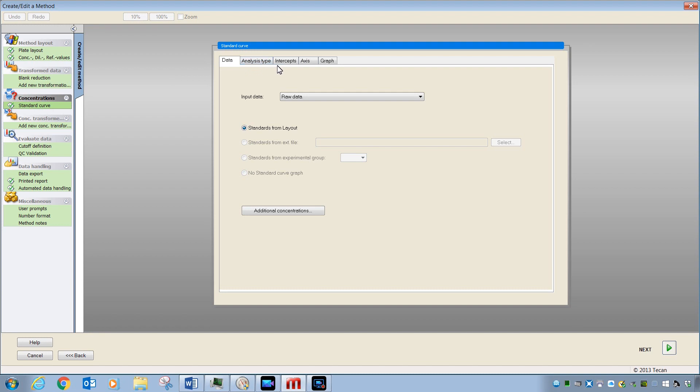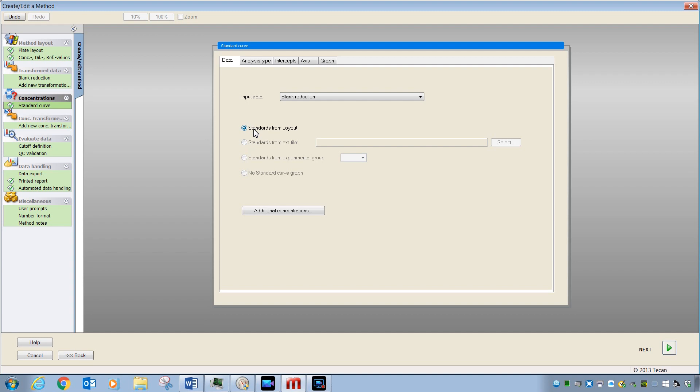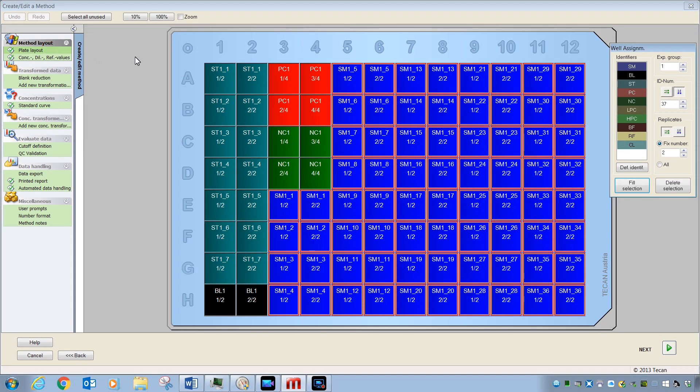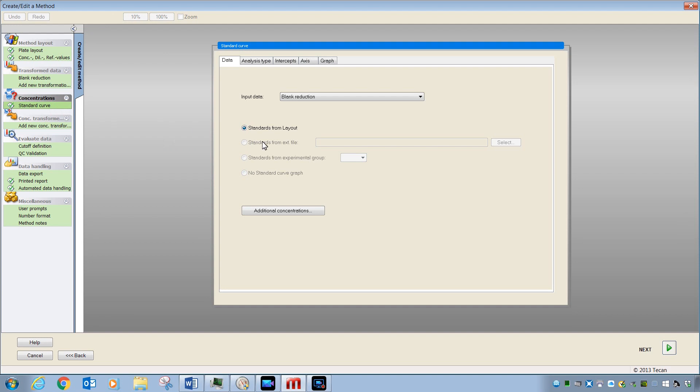There are multiple tabs here. The first of which, with data, is where you can select whether you want the raw data to be plotted or the blank reduced data to be plotted. Also, by checking this button, we are making sure that the standards from our layout over here and the values contained within these will be used to plot the curve. There are ways to generate data with Magellan, save standard curve files, and use them here if you don't have standards on your plate layout. We will cover that in a different video.